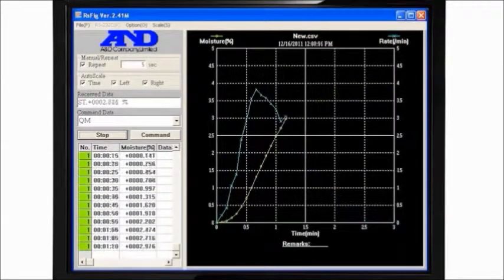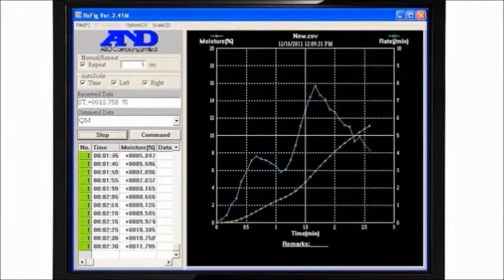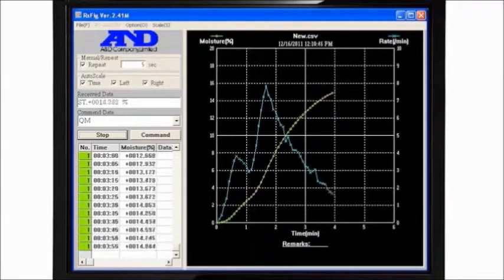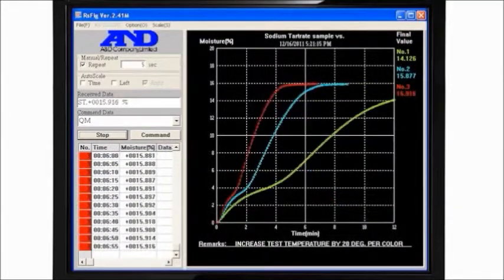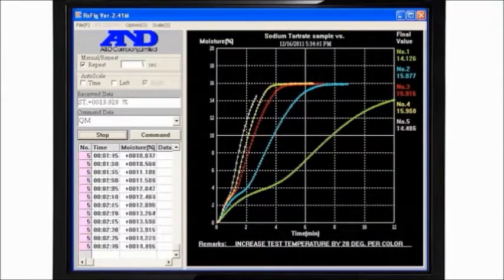Here, WinCT plots moisture content as it reaches its final value and the change in moisture rate approaches zero, indicating the sample is now dry. Successive measurements at different temperatures are graphed in different colors.